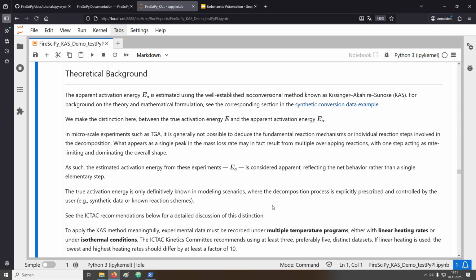Welcome. In this video I will be talking about how to determine the activation energy for pyrolysis reactions from thermogravimetric analysis experiments. The video builds on the previous one and I suggest to watch it first. For the computations, the Python package FireSciPy is used.